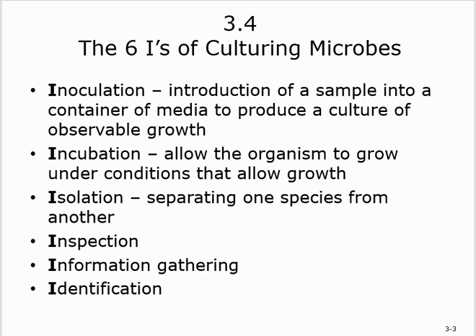So how to do a culture? We are doing a culture. What's a culture? You take a specimen that contains an organism, and then you put it on a medium. You allow it to grow. You study it. You identify it. Like you have a certain disease, whatever it is. We are suspecting something. What exactly is going to happen? We are suspecting meningitis, for example, or whatever it is. What are you going to do? You take that and put it in a special medium that will allow it to grow, and then you observe that, you look at it, you inspect, and you know what it is, you identify, and you tell exactly what this is.